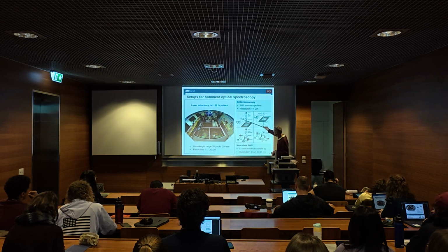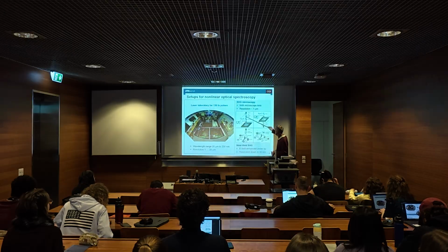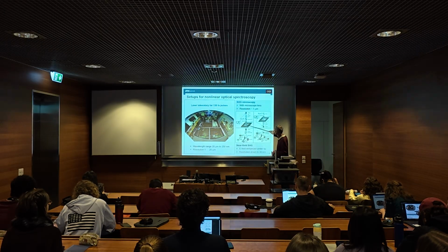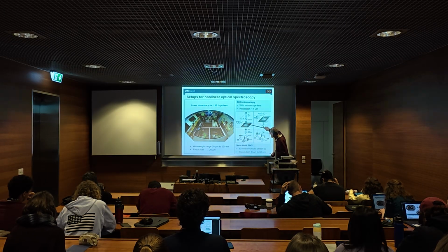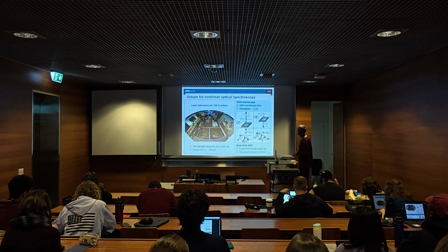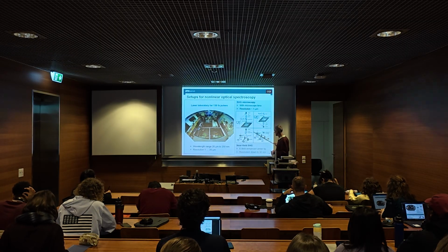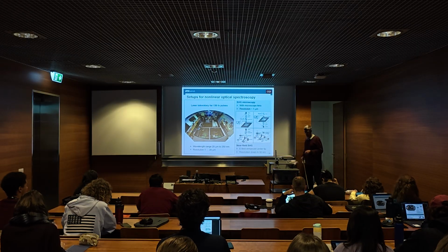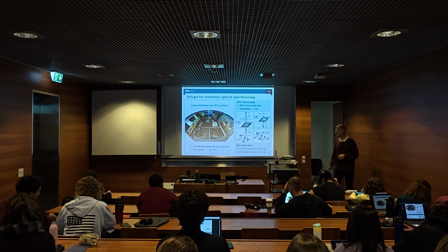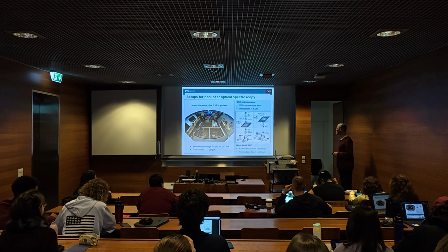So you send laser light, possibly going in through some fiber into your microscope, and then it goes through the microscope, is focused on the sample, light is reflected back and then kicked out by this dichroic mirror, and then you detect it in some sensor. There are different modes to do this that I'm not going to discuss in detail here because it goes a little bit too far in any case. That's how you detect these frequency doubled contributions.